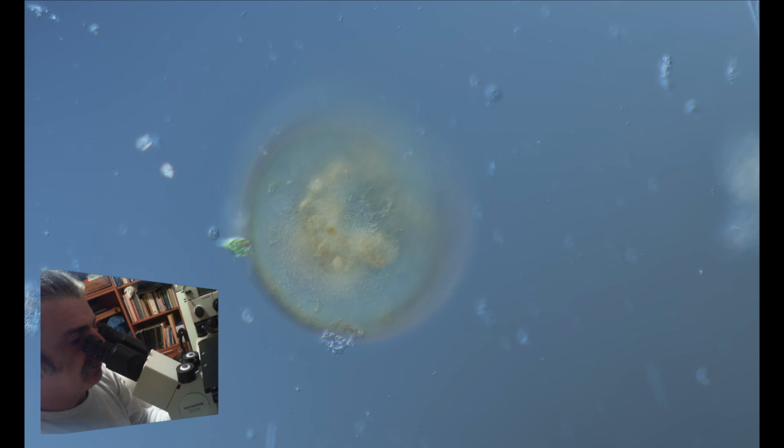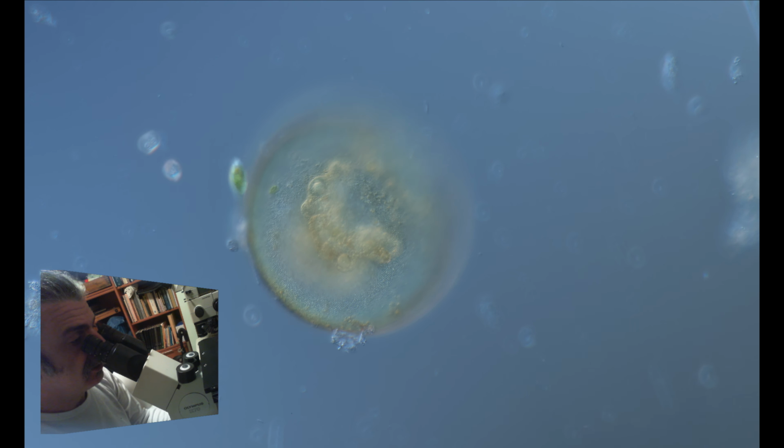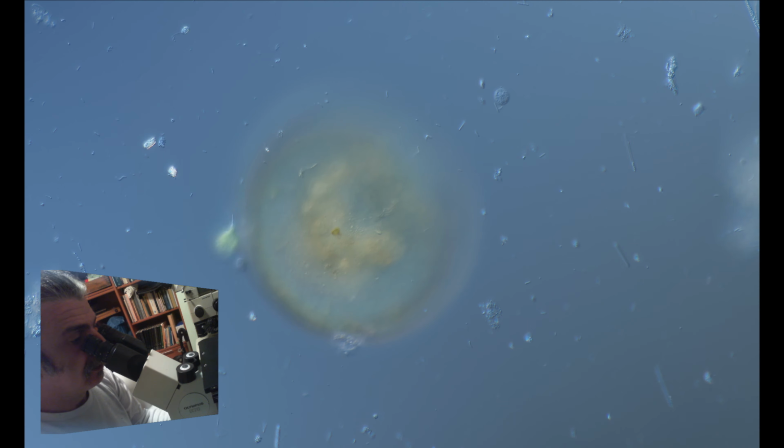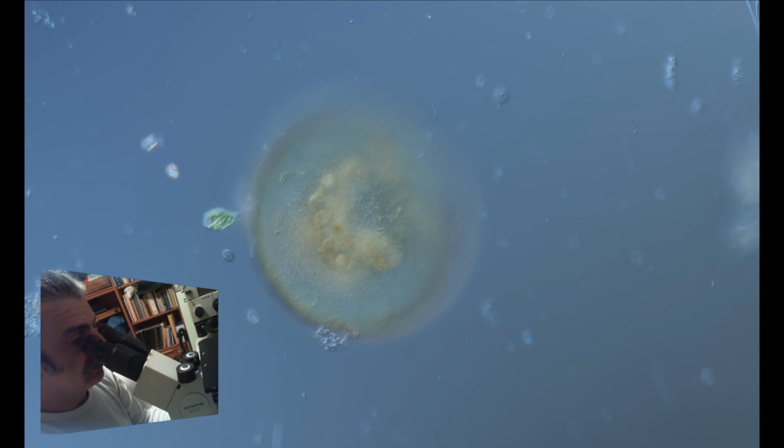Here is another Arcella. The difference in color is due to its age. Older ones absorb metal depositions from the water, so they get dark and orangey, like rust.